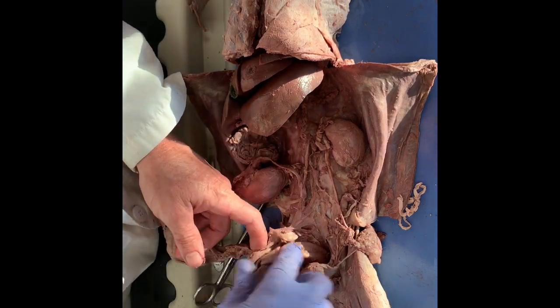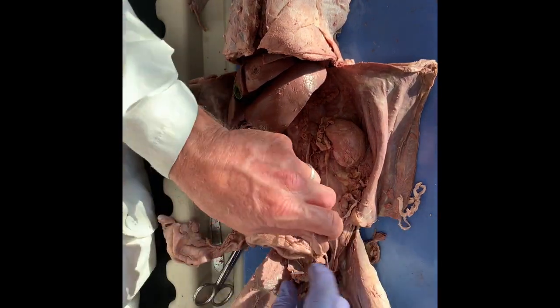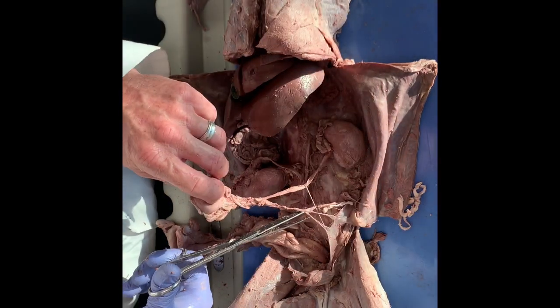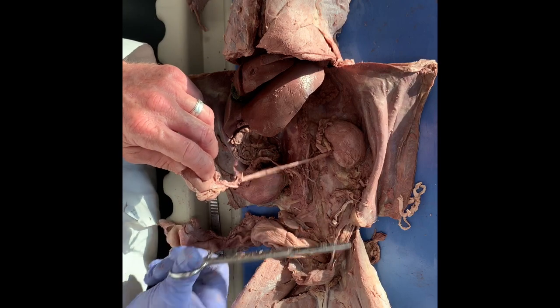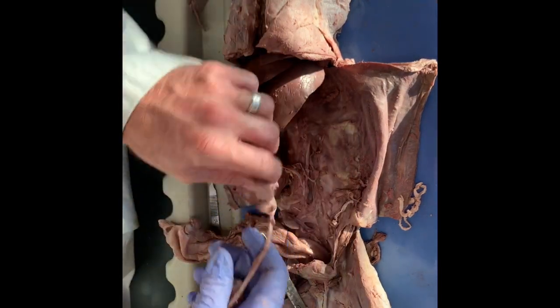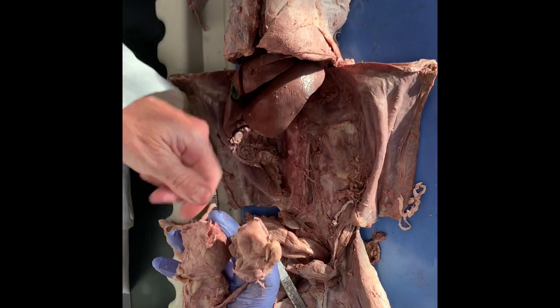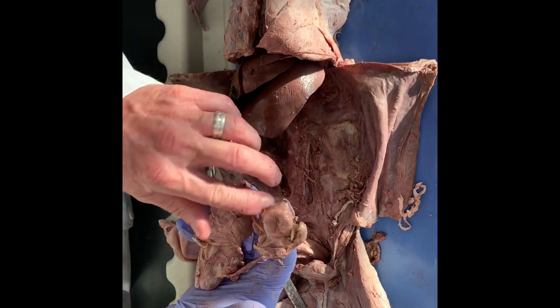So here's the bladder right here. So I'm gonna cut these connective tissue. And then here's the kidneys, here's the ureter. Both ureters are supposed to come over here, and the bladder.